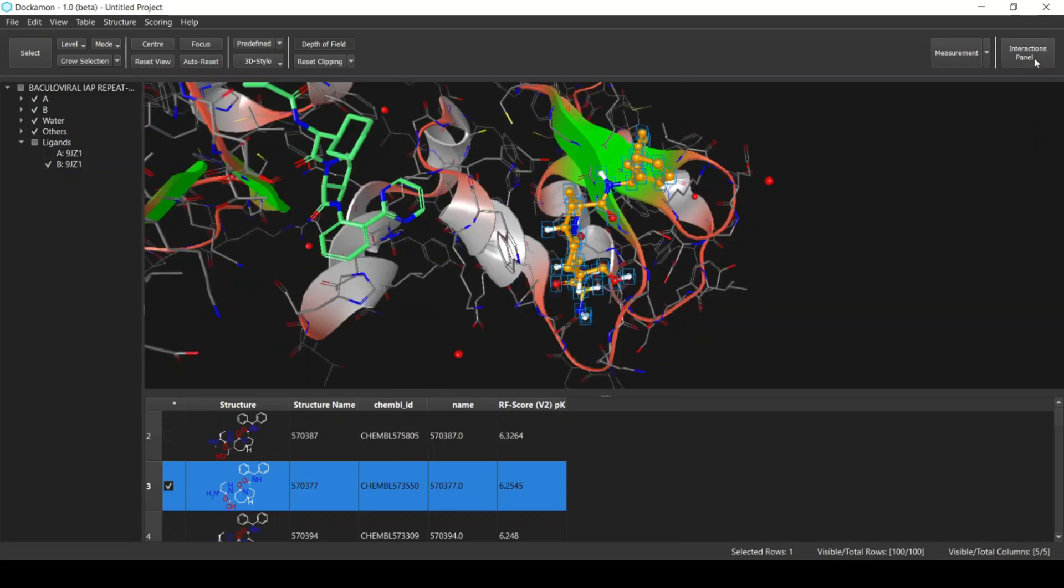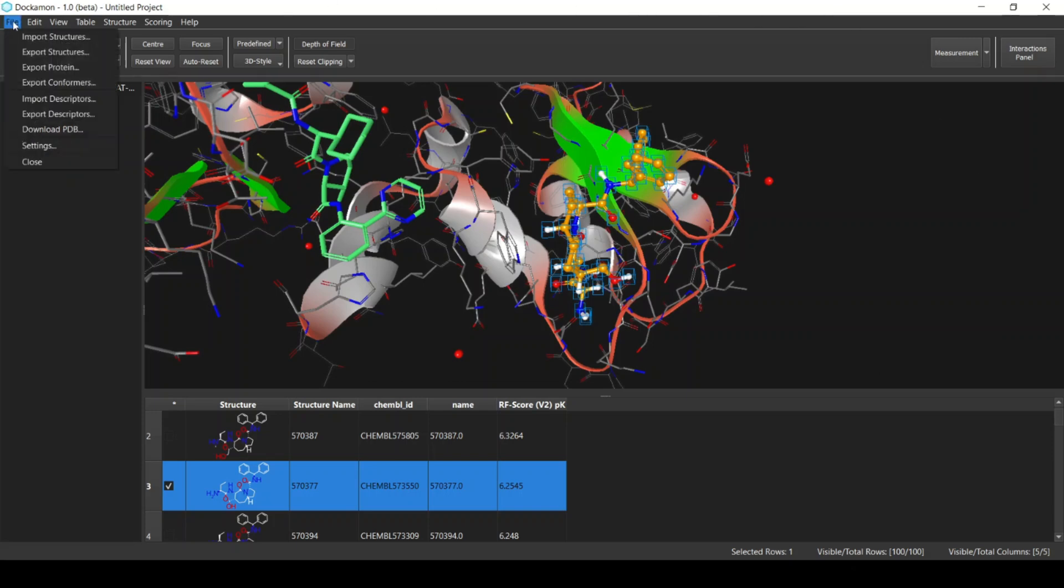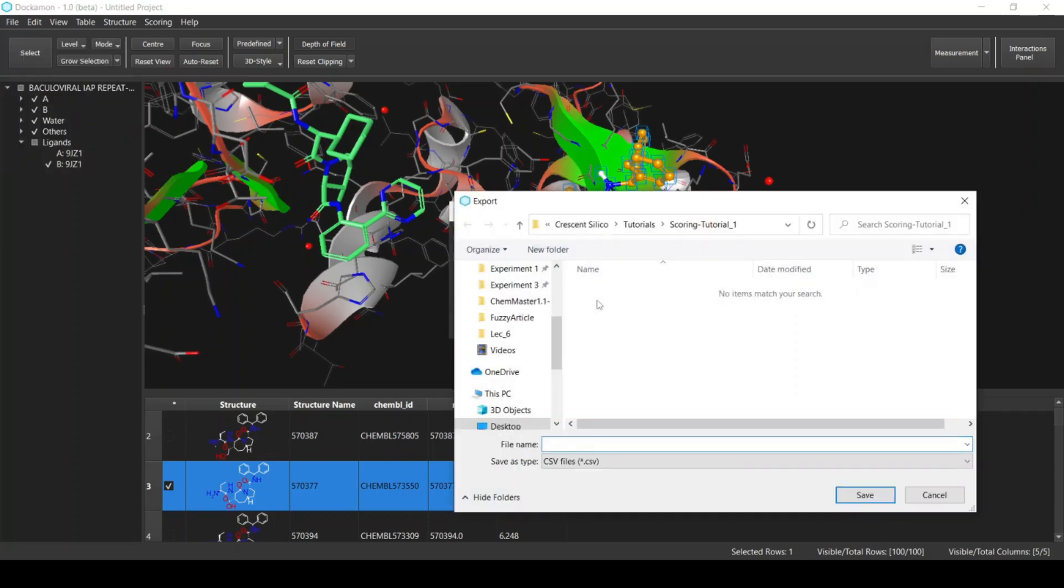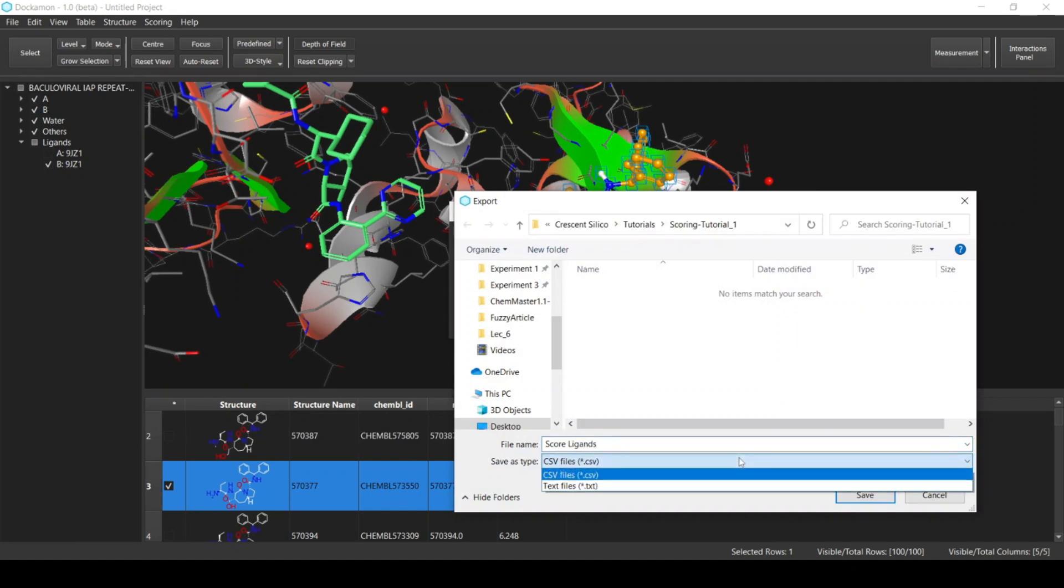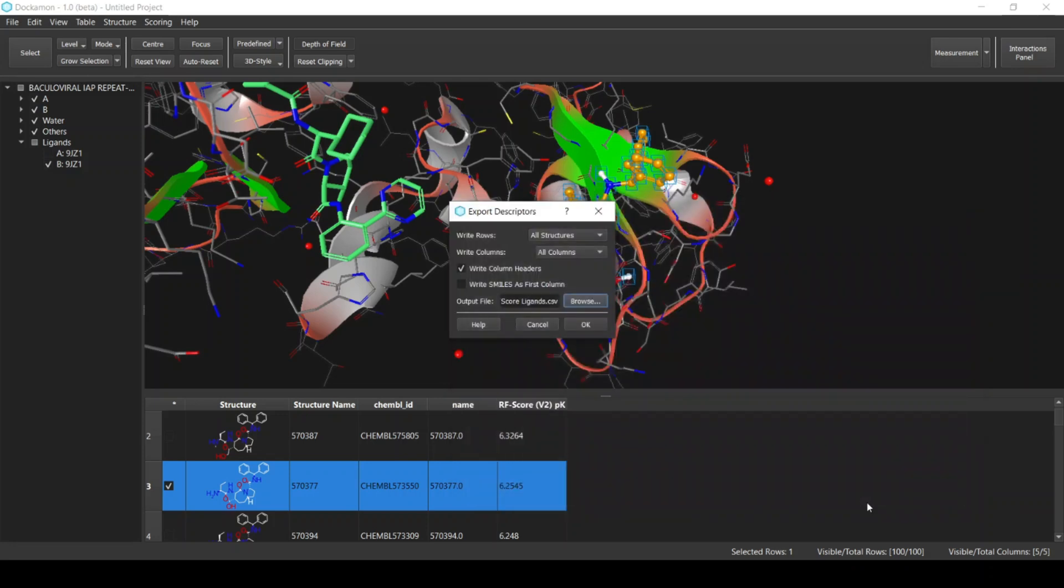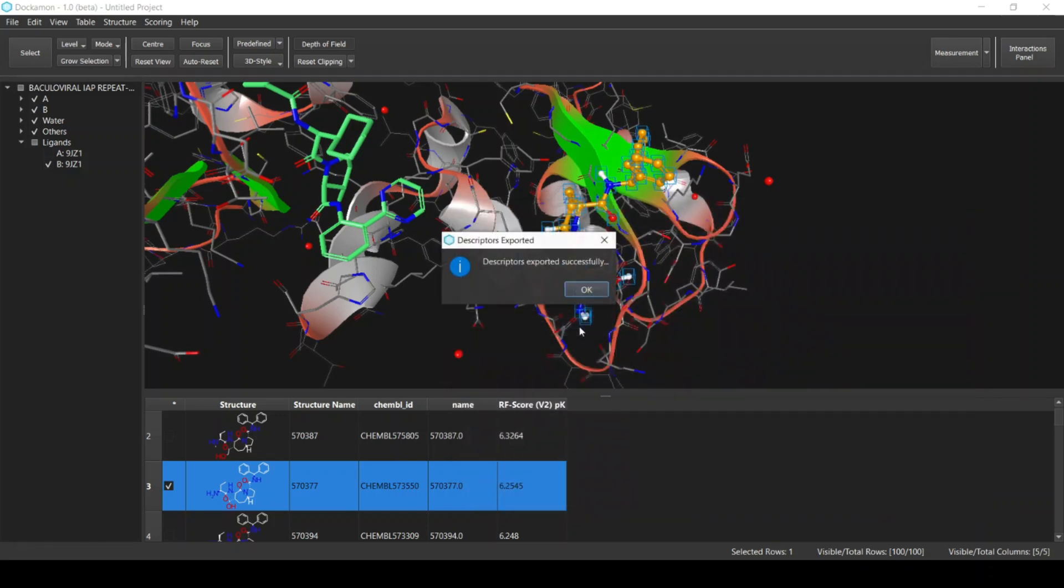You can export the results, for example as an SDF file or as a CSV file. If you want to export the table, from File select Export Descriptors and then select the output file. Select it as a CSV or as a text file. Then click Save and click OK, and the table is exported as a CSV file.